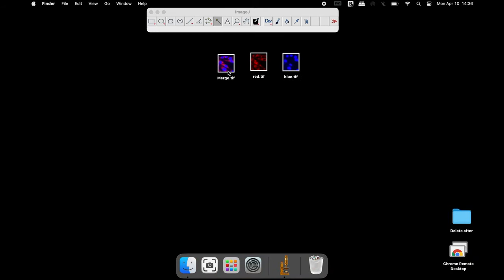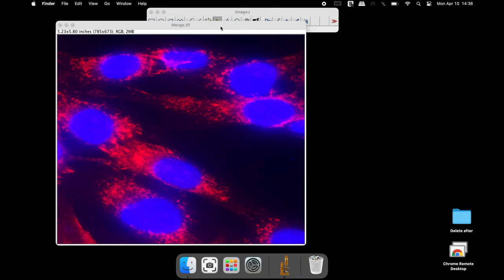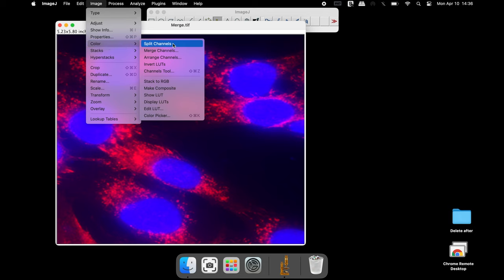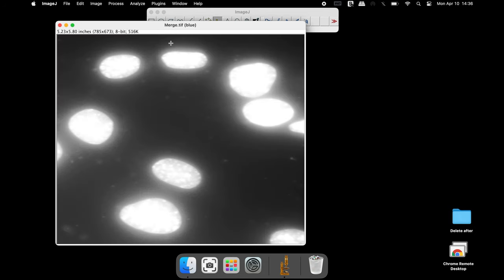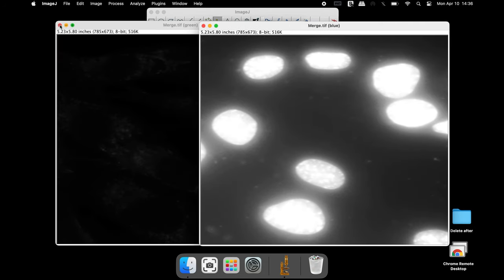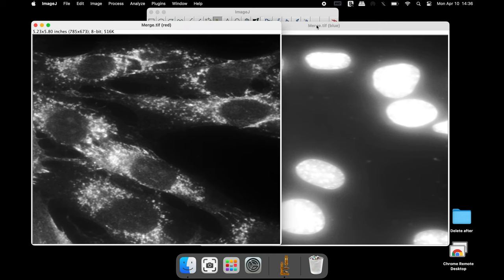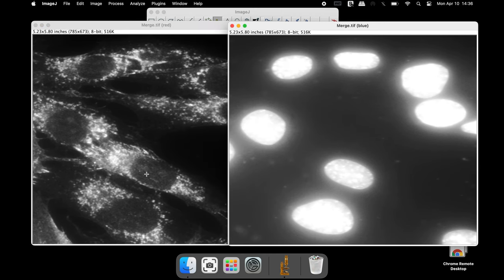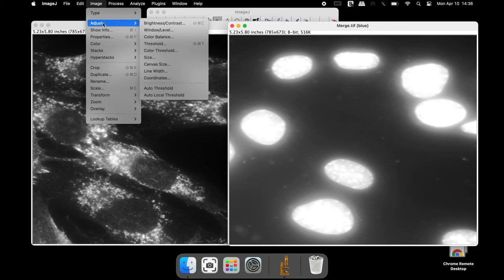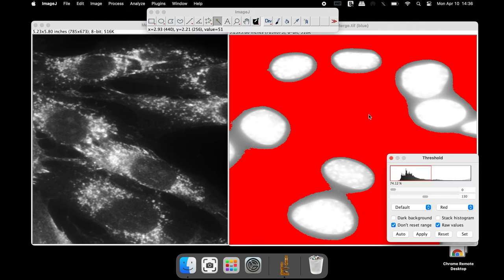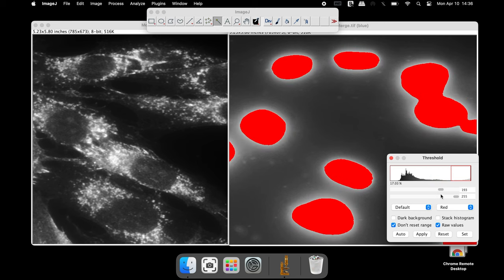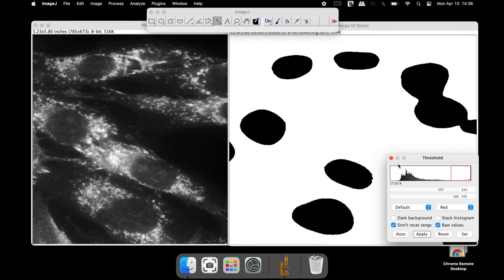Now let us measure the staining intensities of a single cell. Open the image of interest and split the channels of the image as before. Select one of the nuclei — that is, the DAPI staining from the right hand side and its corresponding cytoplasmic staining on the left hand side. Adjust the threshold of the nucleus until the foreground is red in color and then click Apply.